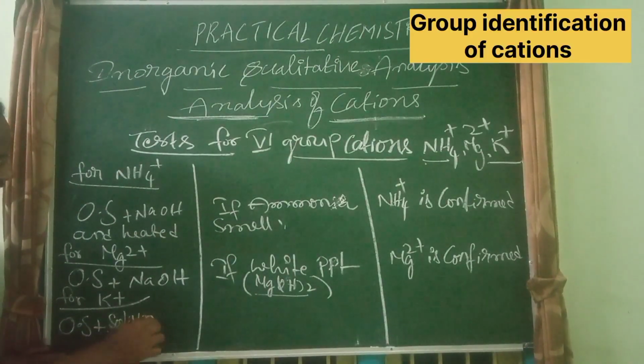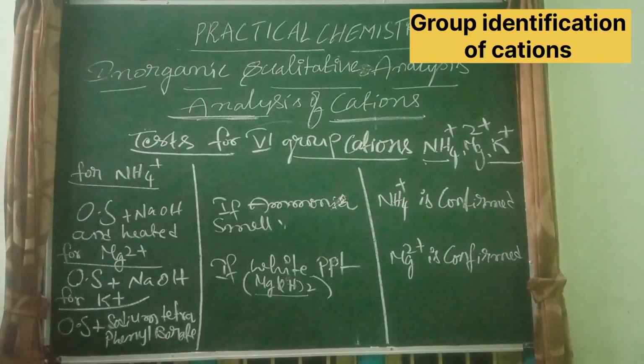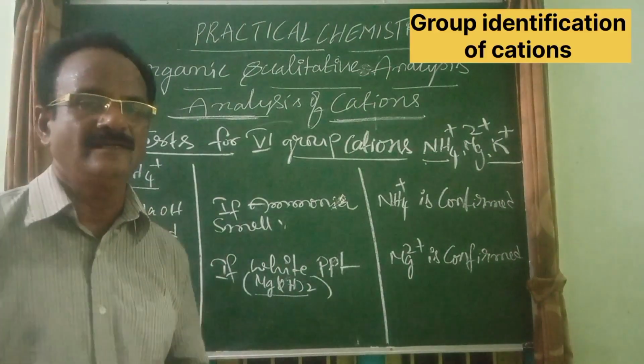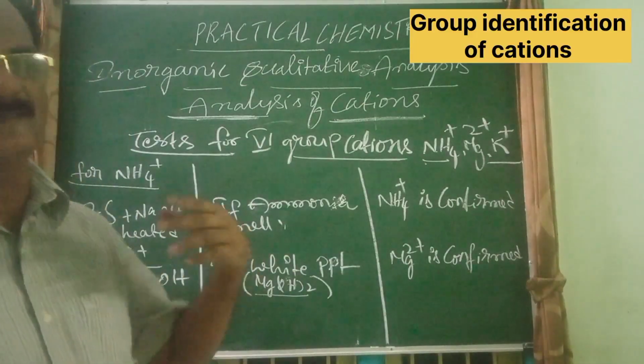Sodium tetraphenyl borate is to be added to the original solution if you suspect there may be K plus in the salt.